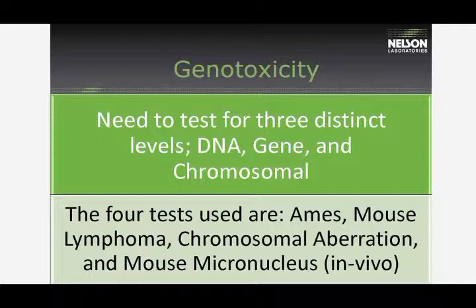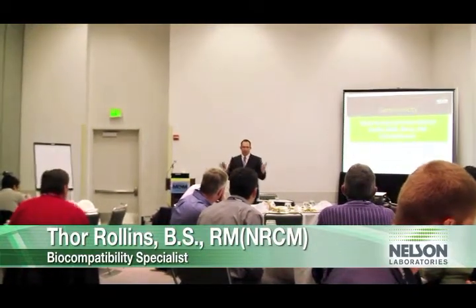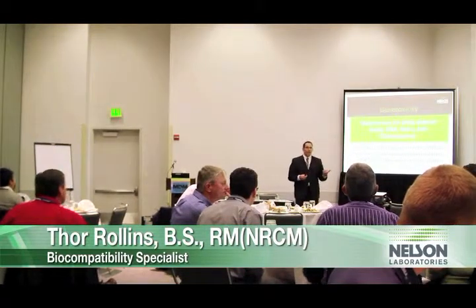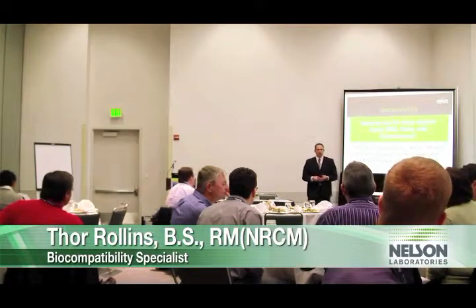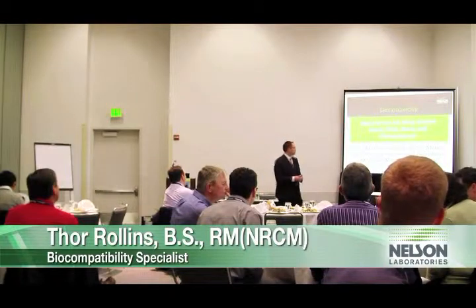Genotoxicity is very necessary. It's a precursor to cancer. If your sample has something on it, or if there's some kind of leachable coming off your device that impacts the genes, then those impacts are going to be propagated from cell to cell, and sooner or later you have potential to cause cancer. And nobody wants to have their device cause cancer. So genotoxicity is very important. It also helps with your justification of carcinogenicity. So if you want to justify out of your carcinogenicity testing, genotoxicity is very helpful.